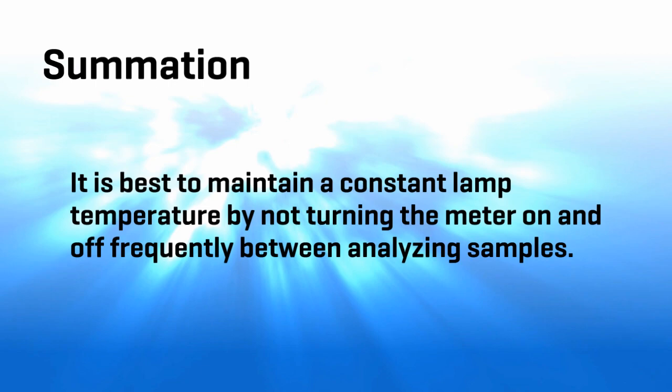Maintaining a constant lamp temperature. This is important. I'm not saying that if you're doing two samples a day, one in the morning and one in the afternoon, you have to leave your meter running all day. But if you're doing multiple samples right in a row, I would leave the meter on for as long as you possibly can, because once that lamp hits the right temperature, you don't want to be shutting it off, turning it on, shutting it off if you're doing a lot of readings in a row.